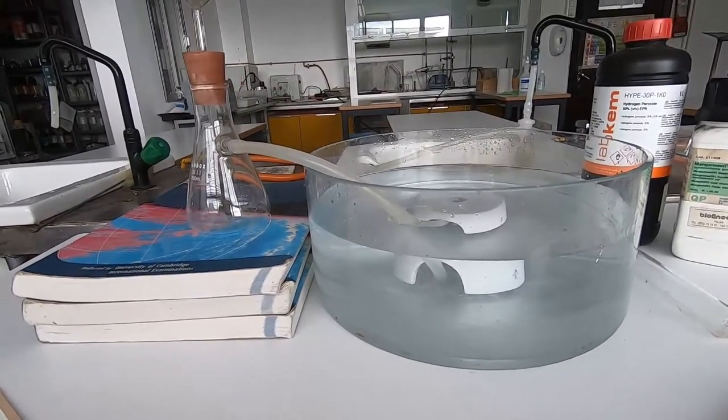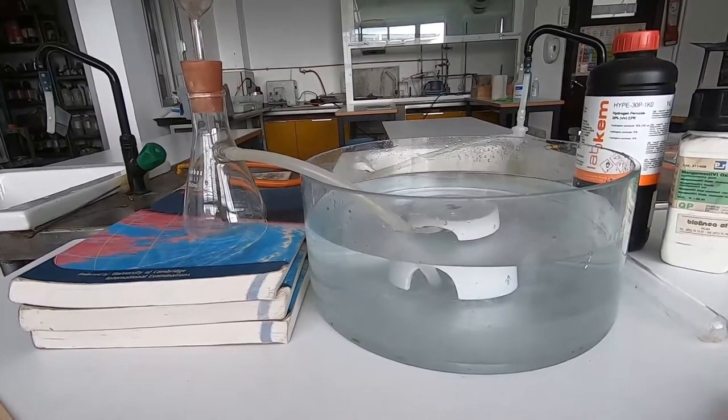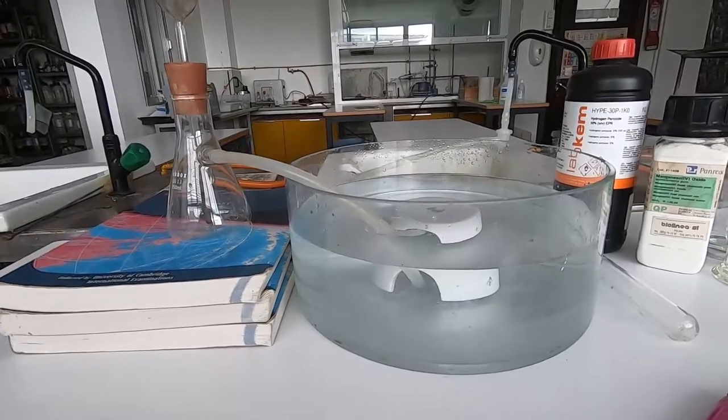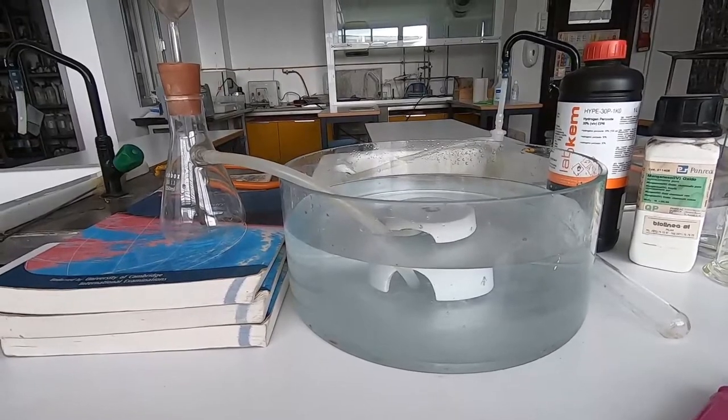In this experiment, we're going to prepare oxygen, we're going to test for oxygen, and then we're going to have a look at some different substances that will burn and how well they burn in oxygen.